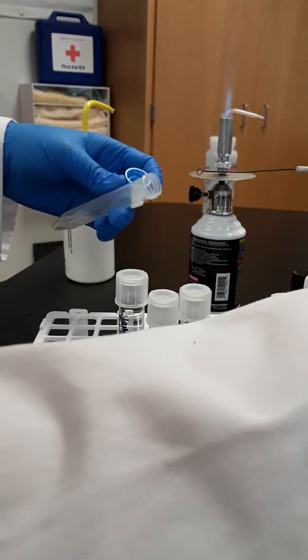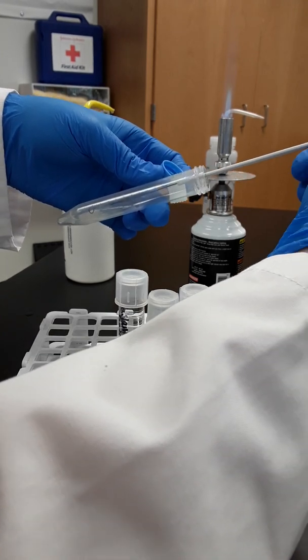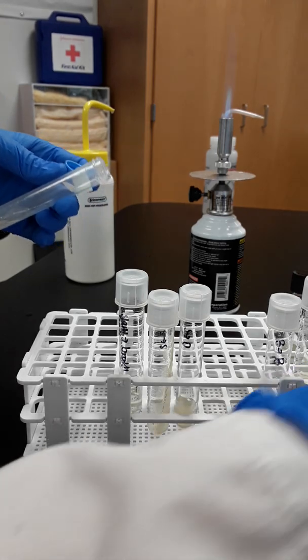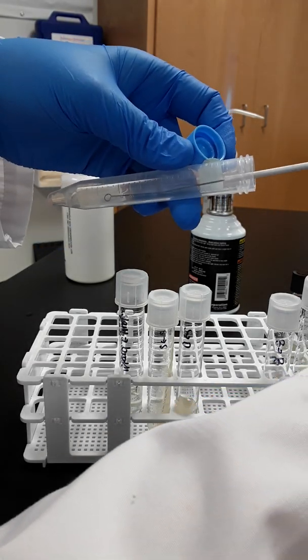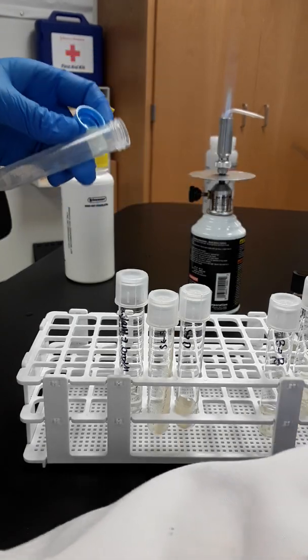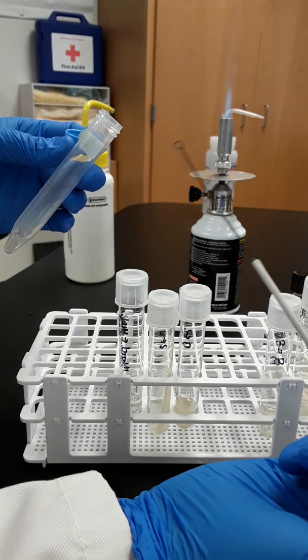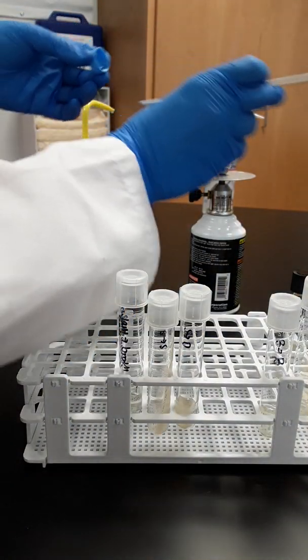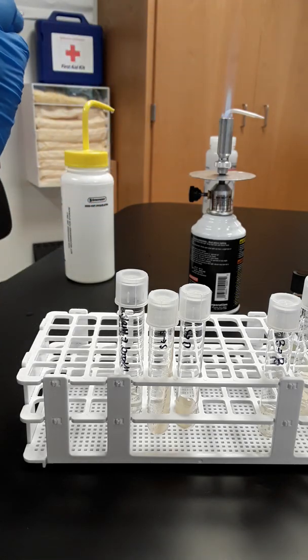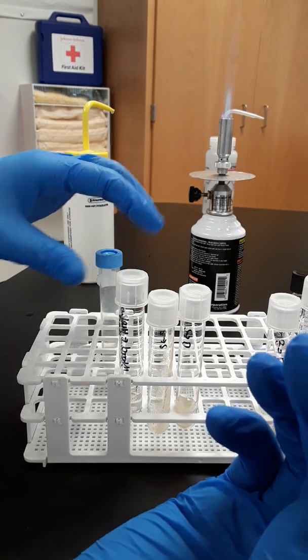So now we take this loop and you insert it, and you just kind of pull a little bit up. You just want to tap the loop, a little closer, onto at least one colony. So now we have a colony on our loop. We're going to close up and reflame our sample. That's hot. Very, very briefly, not melting the plastic.